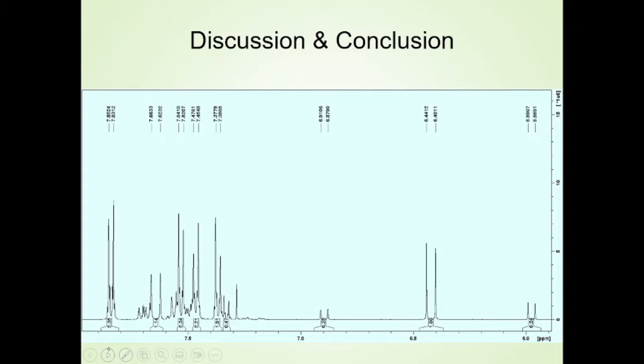The major isomer, you should be able to find all the peaks. The minor isomer, you probably will not be able to find all the peaks. If you can, great. If not, don't worry about it. So for the minor isomer, you may not get all the assignments. And again, that depends on the peaks. And you can identify some of these.